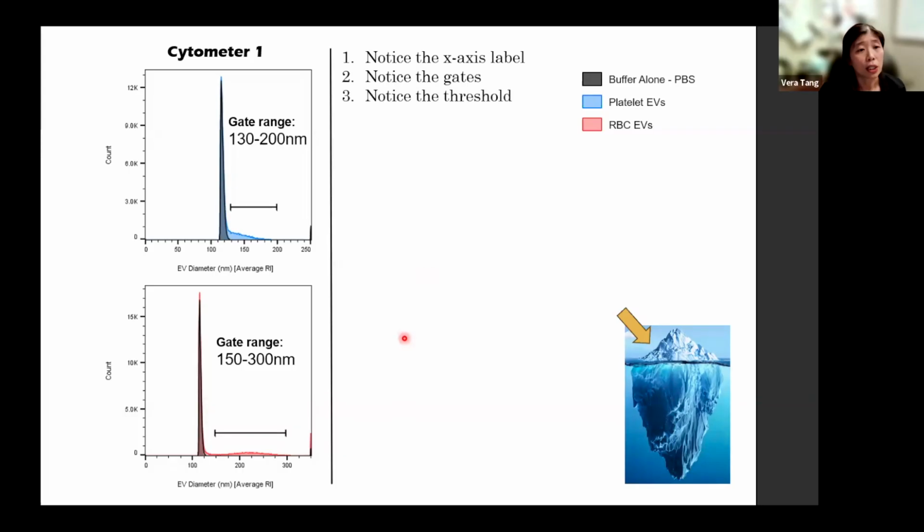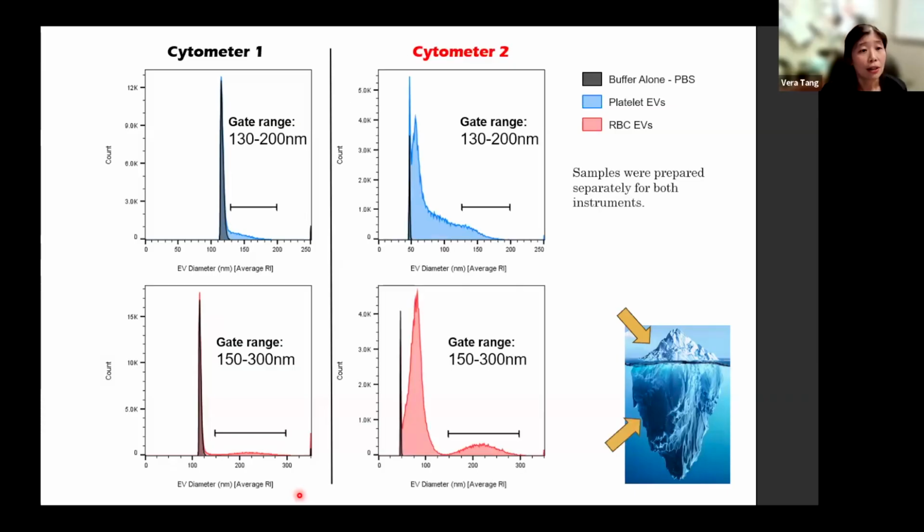So another thing that I would like to draw people's attention to is the actual threshold. So in our workflow, we determine the threshold based on the noise, right? So if you cannot go below the noise, that's obviously your limit of detection, the wall. And we use a very clean buffer sample in order to determine this triggering threshold. So triggering threshold is here. And again, if we have these calibrated units on the axis, we can actually very easily quantify that limit of detection. You can hover over it, you can find a value.